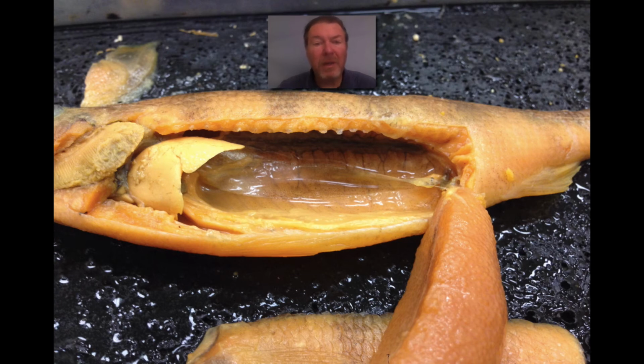Where is, let's see, pick something good here. Where's the kidney? The kidney is this black line right back here. It's against the spinal cord.